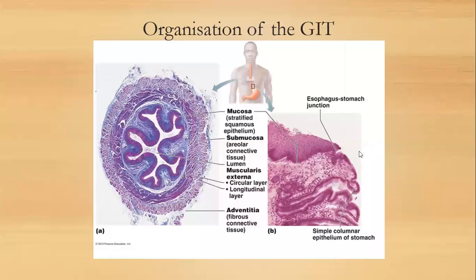Okay, so in this area is where the lumen is, and these are the layers of the stratified epithelium of the esophagus, and these will be in the submucosa, these areas. So when you go deeper, you're going to find the muscular layers deeper in this histological structure.